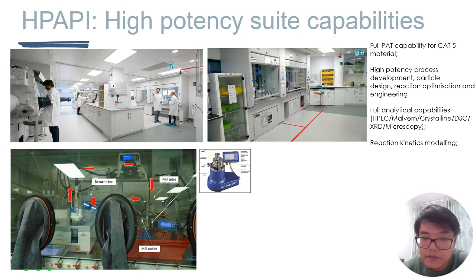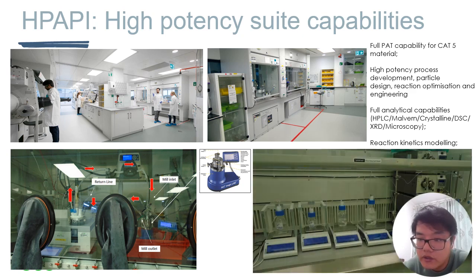The second rig is a rig for antibody drug conjugate reaction. Due to the high toxicity of payload, conjugation reaction has to be carried out in high containment lab. Payload and all other species were prepared in glove box and contained in Duran bottles, which were then placed on top of balance. The mass flow rate of each species was recorded and monitored throughout the reaction.